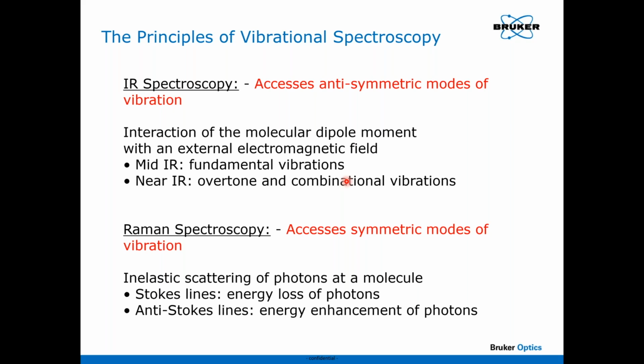So the near infrared can be really useful for doing quantifications because those higher order transitions in the near infrared are weaker. You can integrate over more matter. So for quantifications, the near infrared is really many times superior to the mid infrared, particularly for inhomogeneous material, powders and such. But not as sensitive.